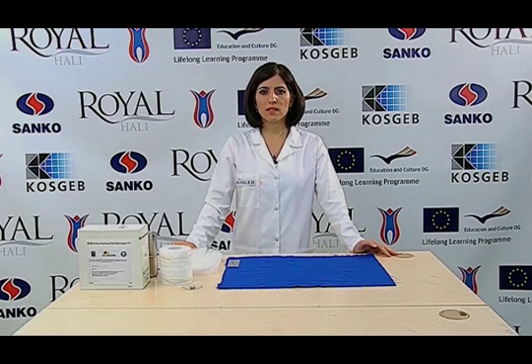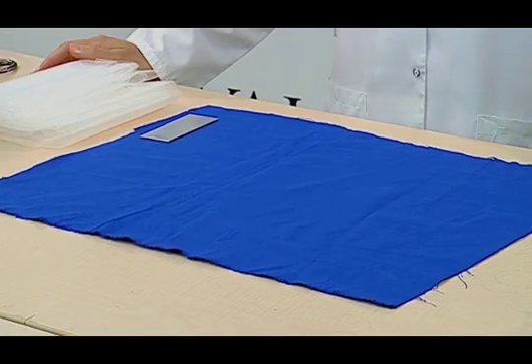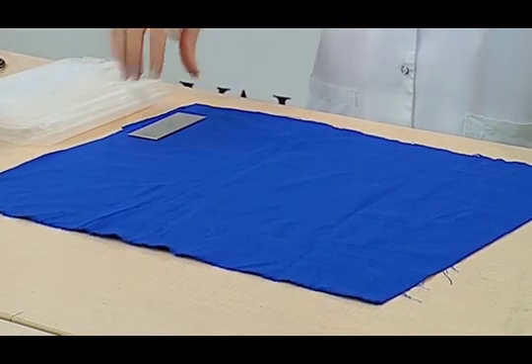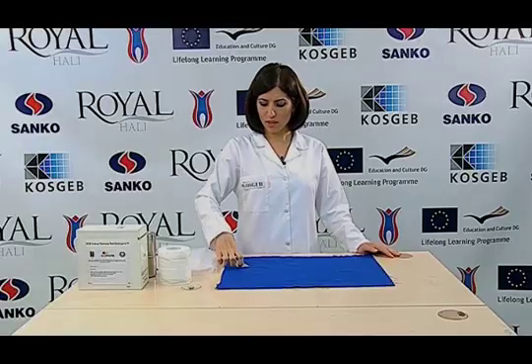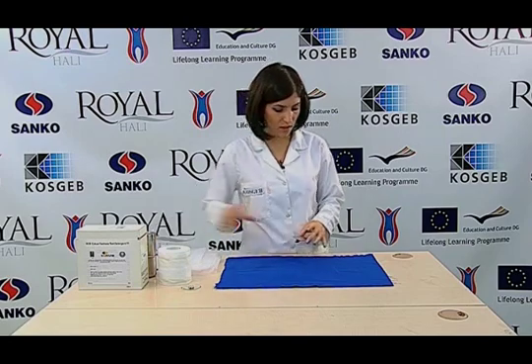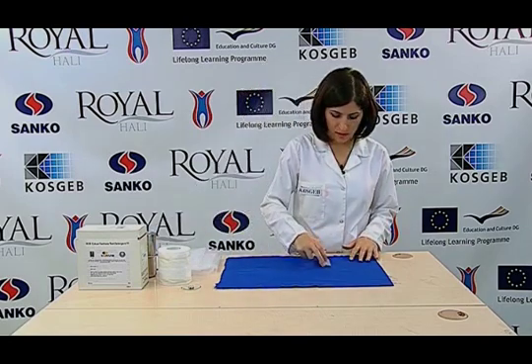To prepare the test sample for the test, it is marked with a template of 40 mm by 100 mm, 15 mm away from the selvedges if the sample is fabric.